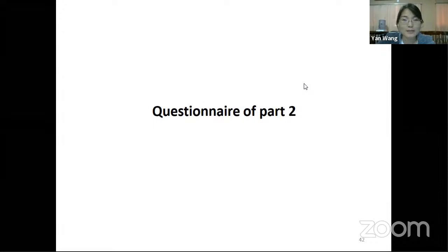So number one, which part of the equipment is not included in preparative HPLC? This is the auto sampler. The auto sampler injects the sample automatically, and this is not included in the preparative HPLC because we have to inject the sample manually, right?